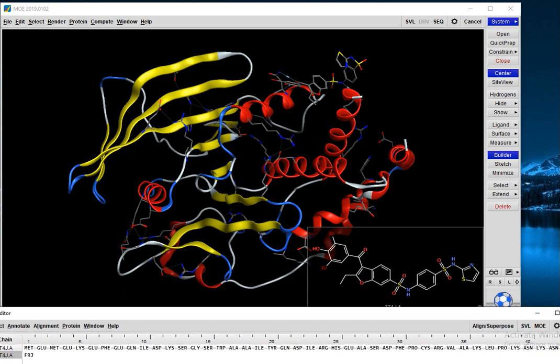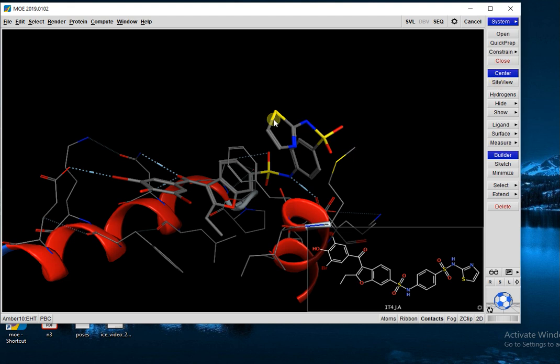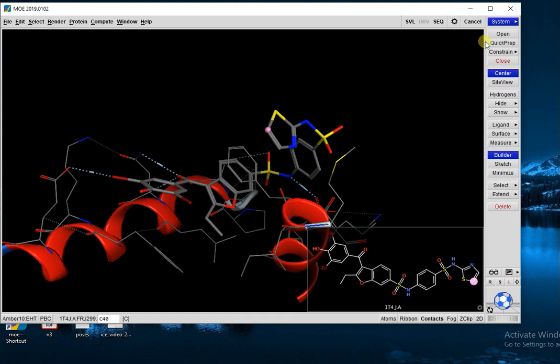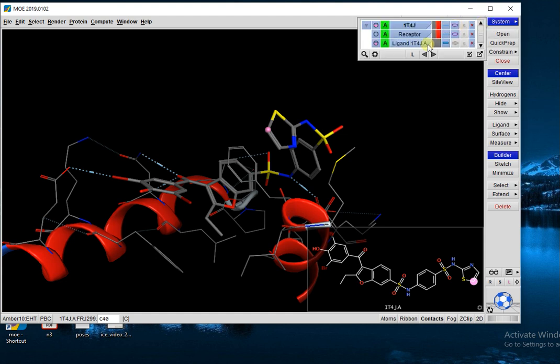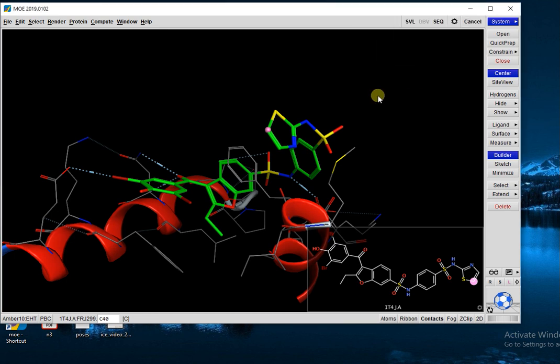Next step is Site View. Simply press here Site View. Site View will show that exact ligand. Next step is go to System, press here System. Here is the ligand. Simply press here and change its color so that you can easily see it. For example, I change its color into green and the color of the ligand is changed and it will be visible easily.